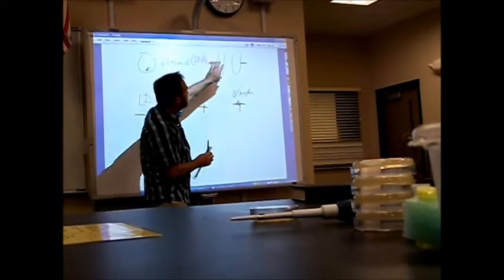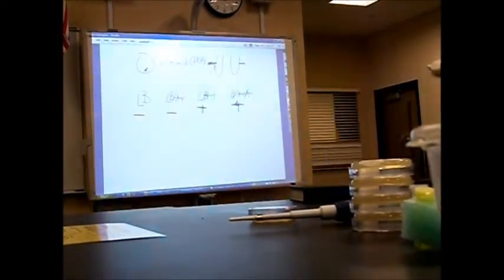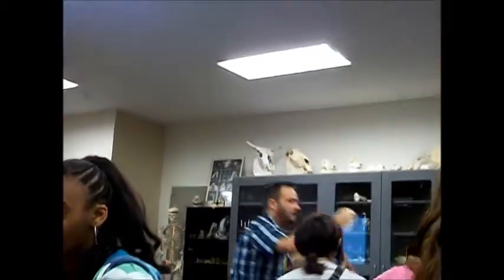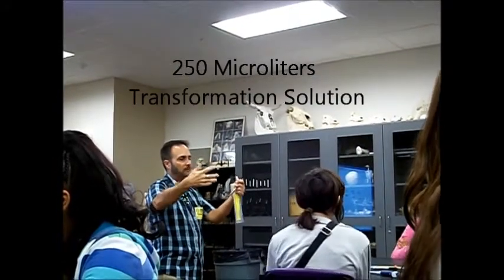So the first part of this, you have to get two tubes, and you all notice you've got two little colored tubes here? And so you're going to label these. What are you going to label these two tubes? Plus and minus, right? And then you're going to take this stuff called TS, transformation solution. That's what you're doing. This is called a bacterial transformation.